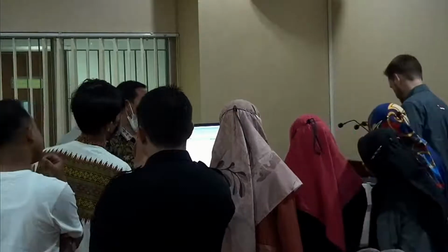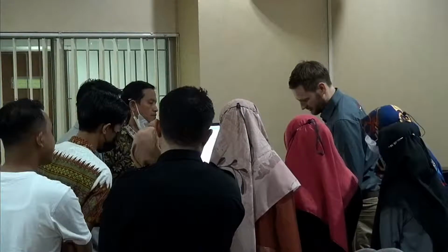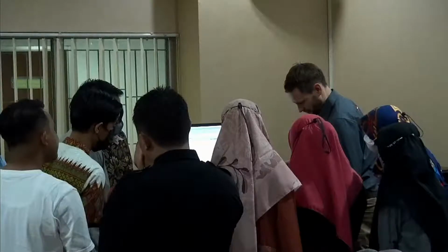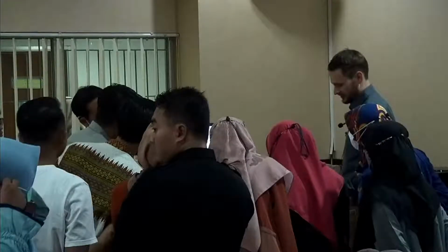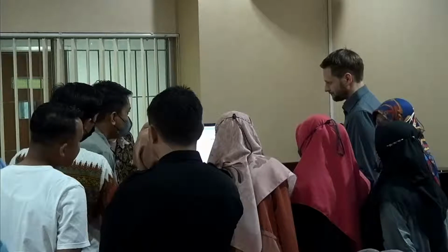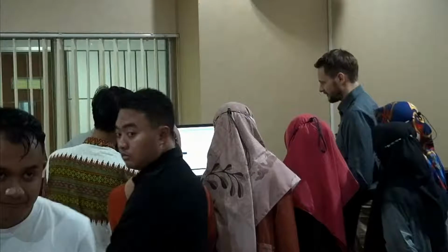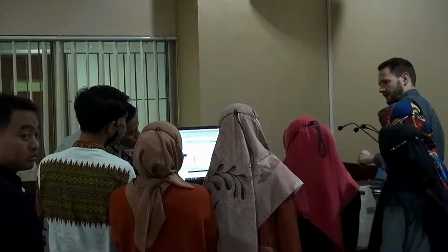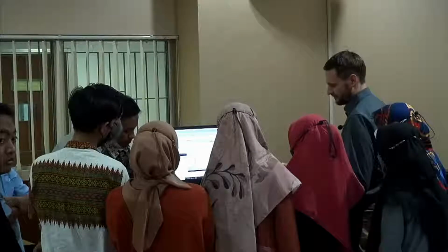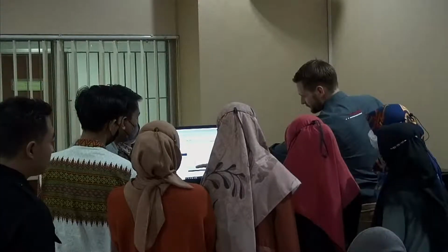And we're already in our sample dilution menu. So at this point we can add the sample, and many questions were how much do I have to add? Well, for the F500 this should be enough. I had the discussion with one person here in the break where I said, yeah, usually you do this by feel, and it's not like you have to experiment with one sample for days. You just start adding a little, and you'll see here, this is the beam obscuration. This shows you, I talked about 10 to 20%, so I think I hit a pretty good spot here.